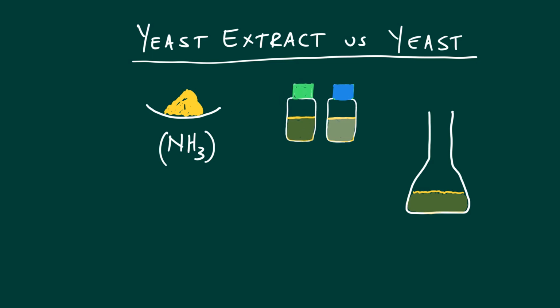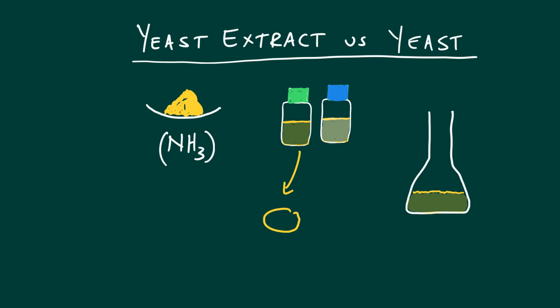If you go to that incubator, the temperature controlled little room at 35 degrees Celsius, you'll get bottles with green caps and bottles with blue caps. You will see that the color of the inoculum, we call it the inoculum because what's in the inoculum is physically cells itself. Okay, so there's that yeast cell, and maybe it's already starting to form a little baby. That little bottle that you take out contains the yeast. Okay, don't confuse that with yeast extract. That's the living material. And really, at the point in time that you add, and please note, make sure to take a green cap if you do a growth experiment and a blue cap if you do a maintenance experiment, that's going to be chucked into your little fermentation vessel. And when you chuck that in, that is time 0. And that's when you start monitoring your reaction.